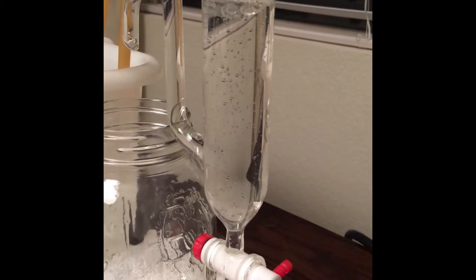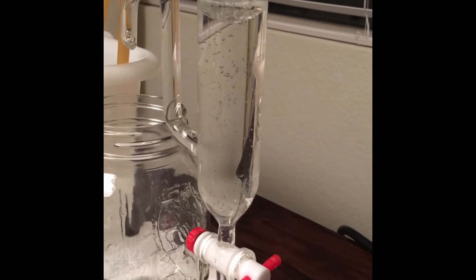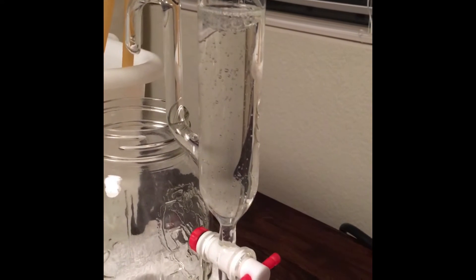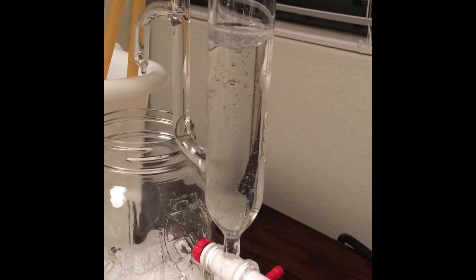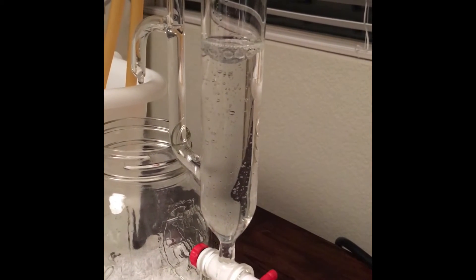This is about an hour and a half into distillation. You can see the oil collecting at the top. It seems to be a fairly heavy oil — all those little bubbles are actually oil that are going to float back up to the top, so you can watch the bubbles burst here.